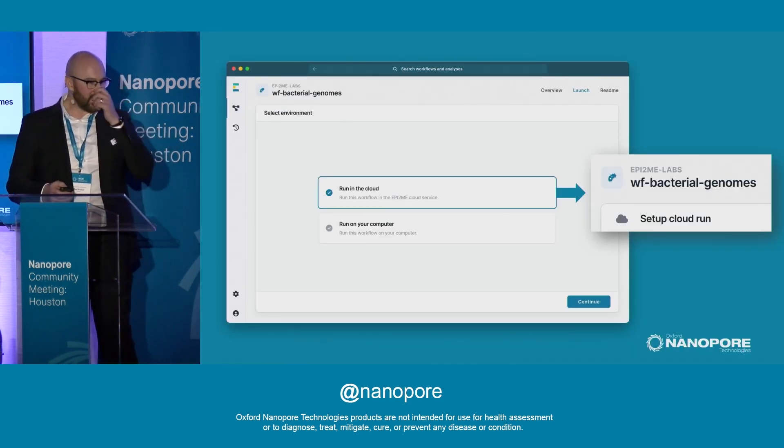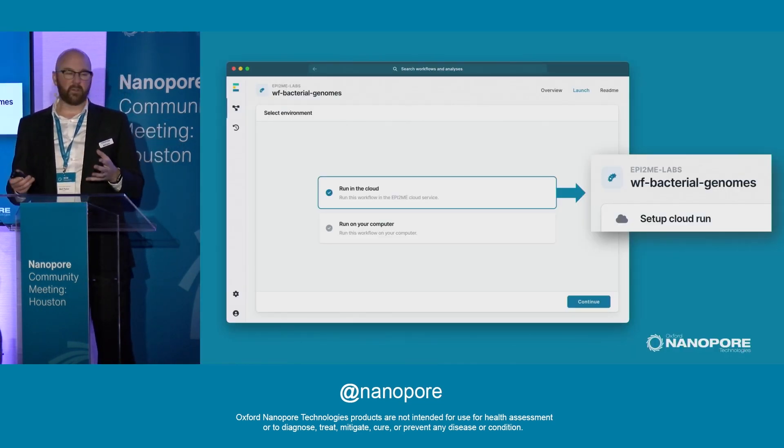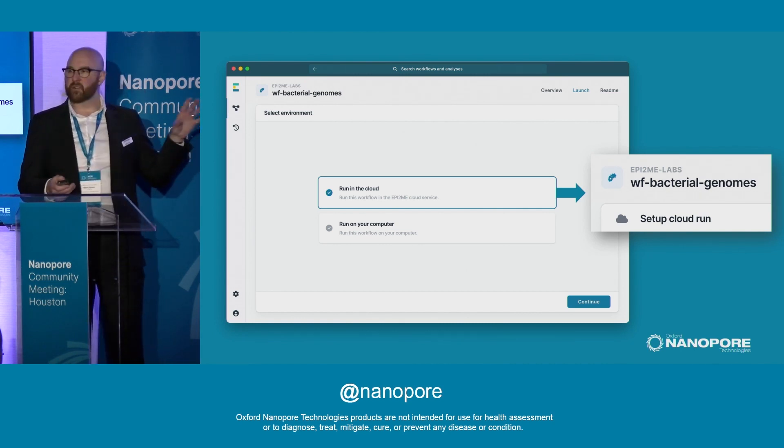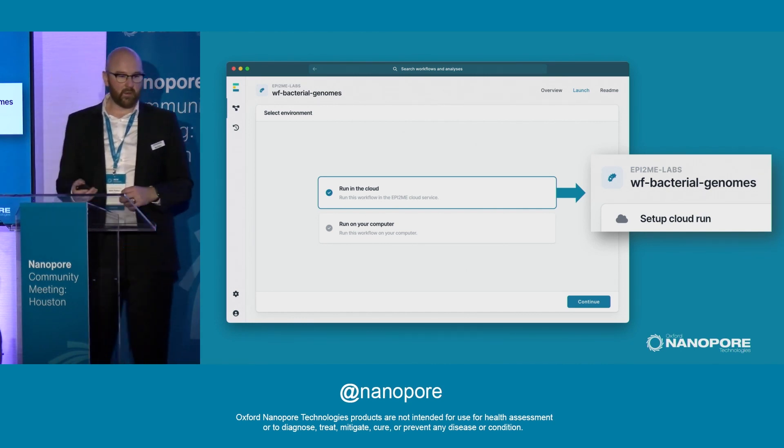This is really, really easy to use. When you select a workflow in Epitome, you'll get the option to run it in the cloud or run it locally.